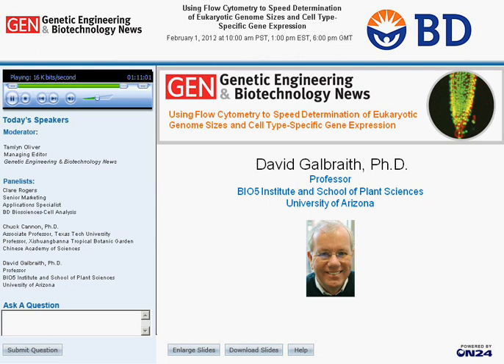All right, David, this question is for you as well. The Accuri cytometer seems to work well, but I'm afraid we can have a problem if we include in a sample any species with staining inhibitors in the cytosol. Do you know how measurements using Accuri would work for these difficult species? Yeah, this is from another old friend, Elvira Slavinska, and she has a lot of experience in this area. And Chuck has also mentioned dealing with problematic species in his surveys.